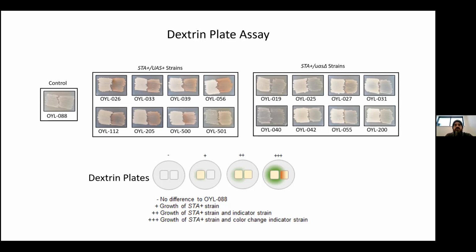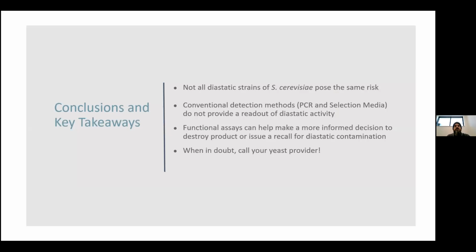So this was a surprise that we discovered just from doing this assay, that there are versions of these STA1+ strains out there that aren't diastatic. So there's a lot more, and if you're super interested in this topic, I'd recommend seeking out that journal article that we published. There are more assays, including some that were developed by our colleagues at Cornell.